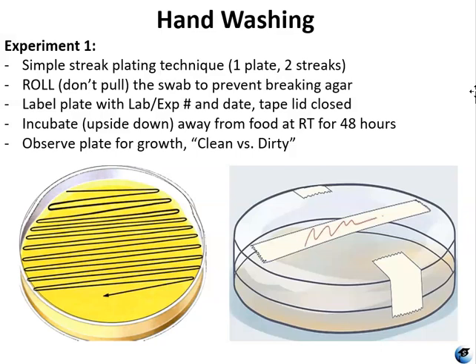You might want to set this up early so it will have plenty of time to incubate. You want to put it in a place that's dark, and also definitely a place that's away from food. After the 48 hours is up, you're going to record your observations. You're going to answer all of the guided questions in the lab report one template. We'll discuss towards the end some more observations you want to make.